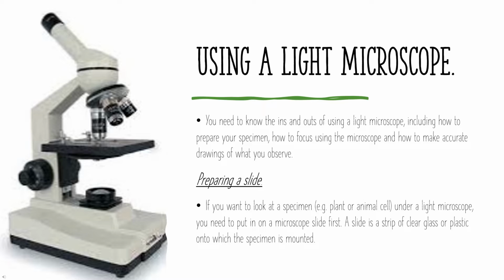So, in today's video, in today's lesson, I'm going to explain to you guys how to use a light microscope and everything you need to know about using a light microscope. You need to know the ins and outs of using a light microscope, including how to prepare your specimen, how to focus using the microscope, and how to make accurate drawings of what you observe.